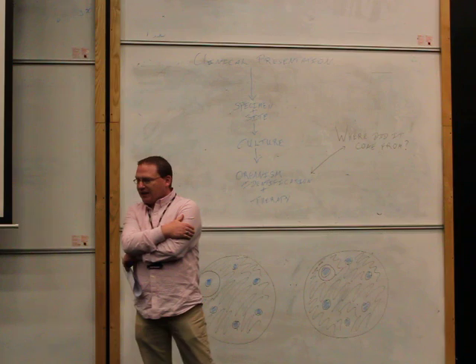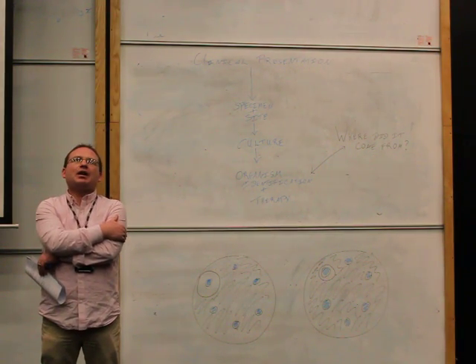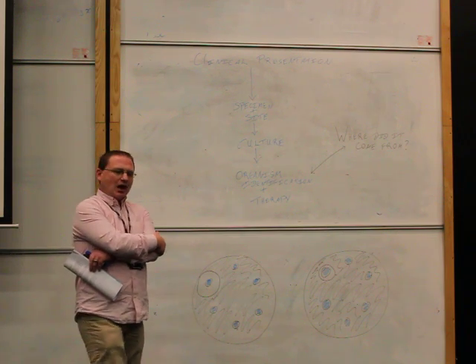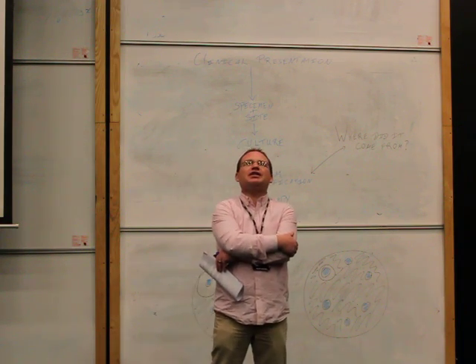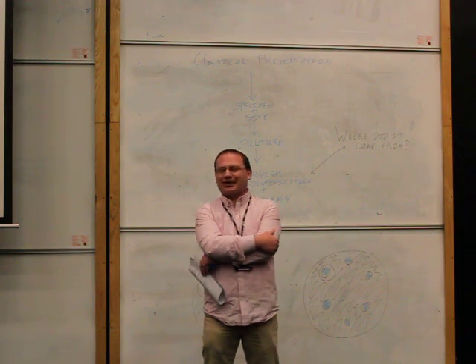So you will also find that we have taken specimens from the staff that were on duty at the time that the baby was born. So you will have specimens from 4 nurses and 2 doctors. Thank you.